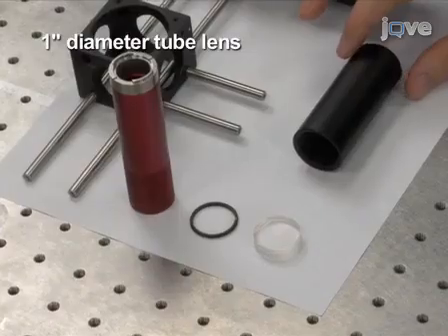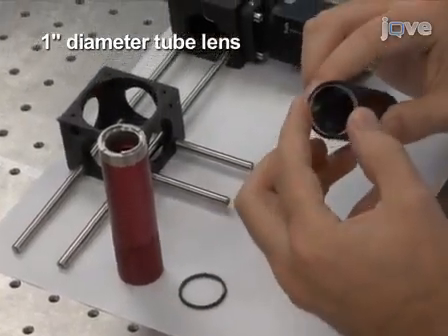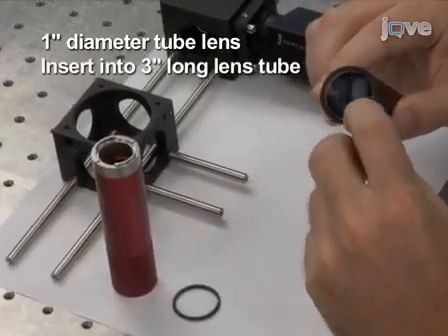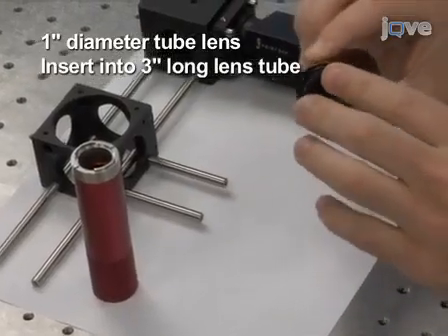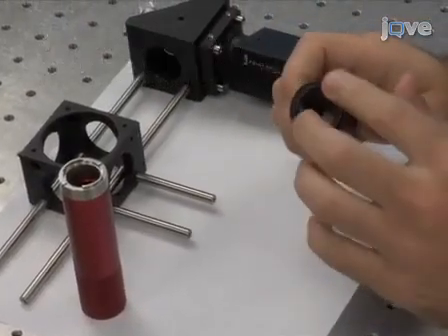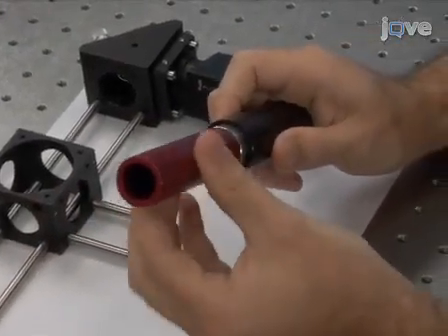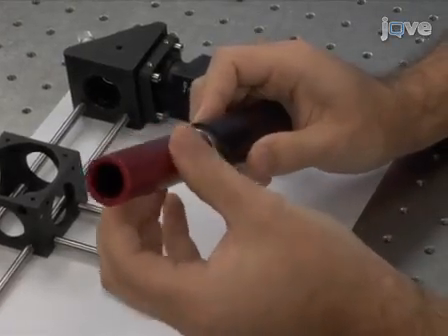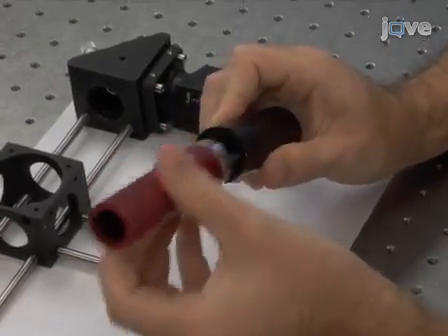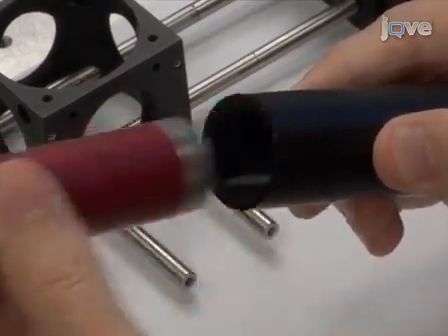Select a 1-inch diameter tube lens to form an image of the fiber-optic bundle on the camera. The focal length of the lens should be selected such that the cores of the fiber-optic bundle are sampled by at least 2 pixels when imaged onto the camera. Insert the lens into a 3-inch long lens tube and secure the lens with a retaining ring. A spanner wrench is helpful for screwing retaining rings into long lens tubes.